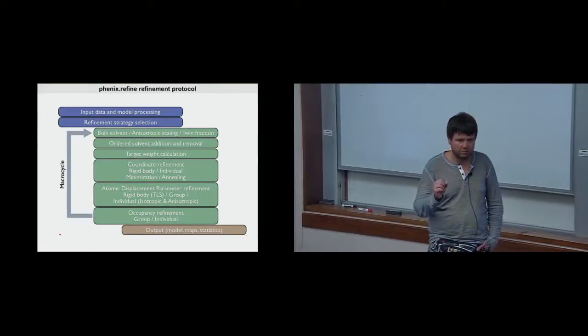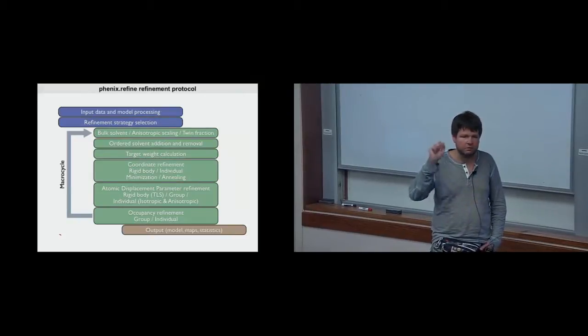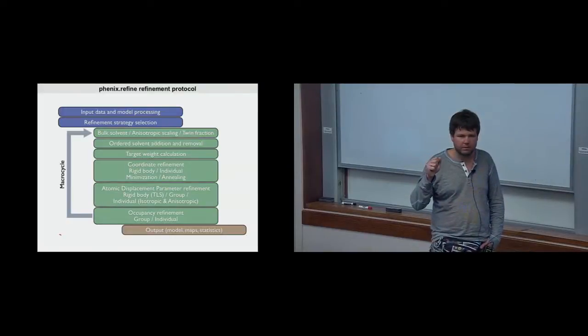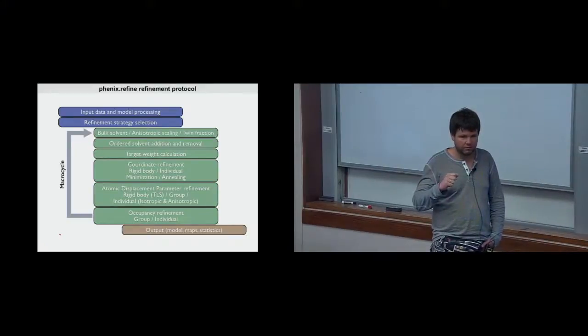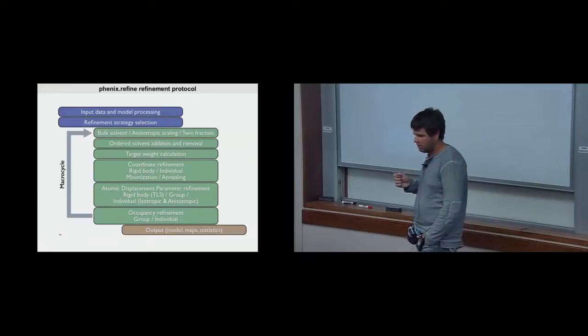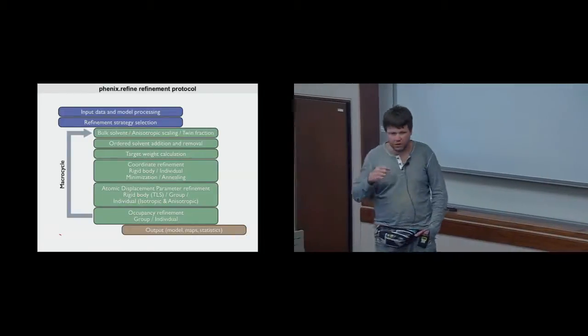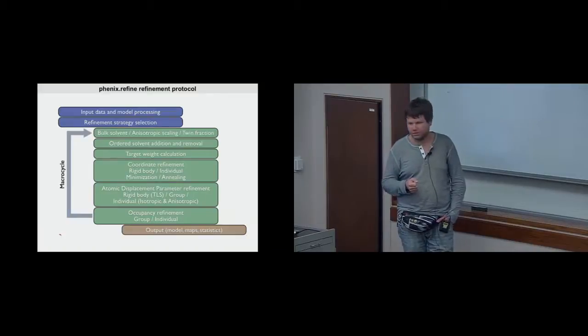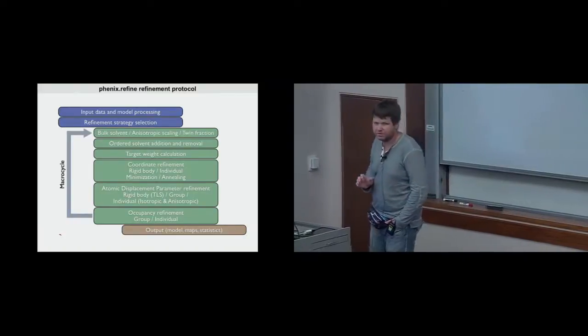And what people usually do is go to Coot and start manually picking the waters. And as you can imagine, if you have a large structure, that might be a very tedious exercise, going one by one. So Phenix.refine can do it for you in one refinement run. It will place all the waters, refine, update them, remove if necessary. Of course, it's a very good idea to check waters manually as a final step, which is a little bit of exercise, but it is nothing compared to doing the whole job by hand from scratch. So that's basically what it does.